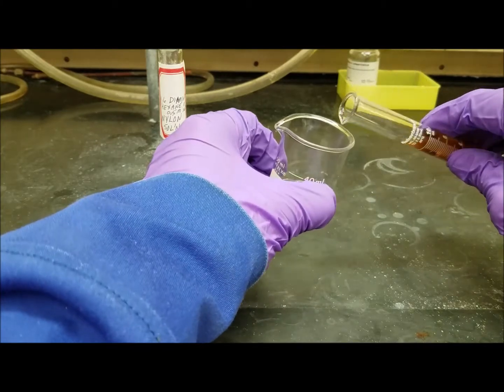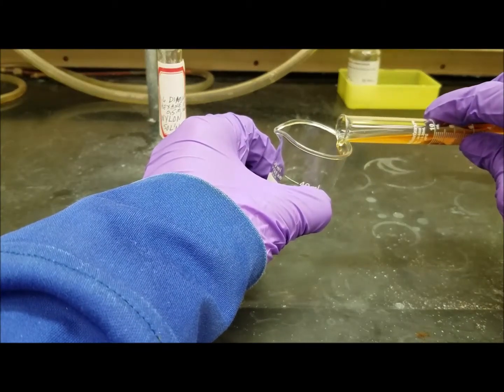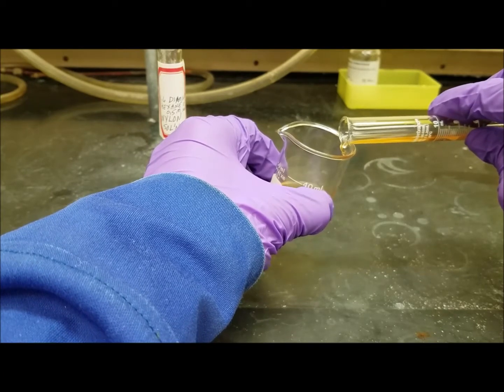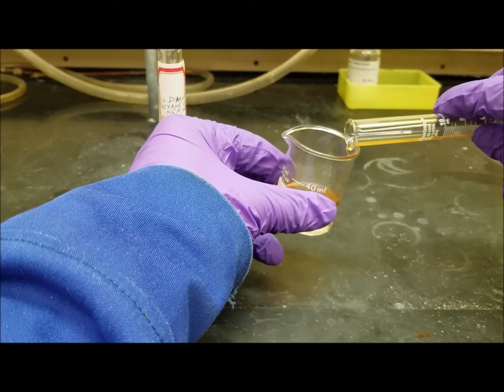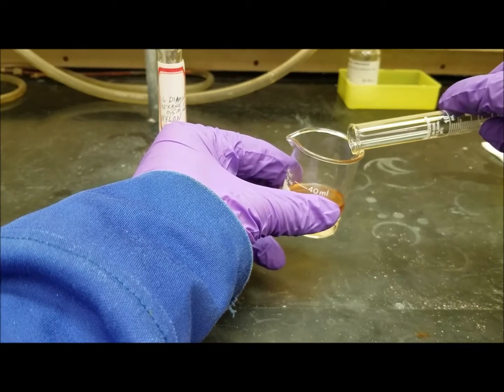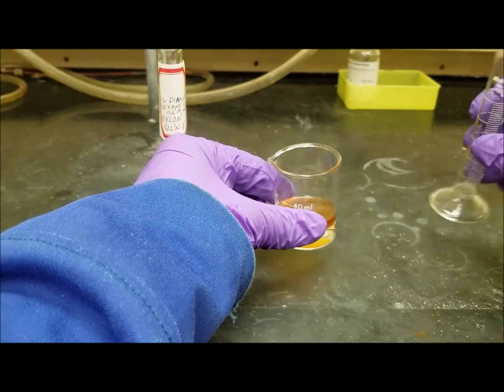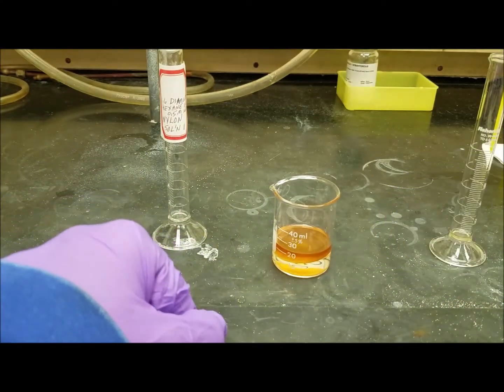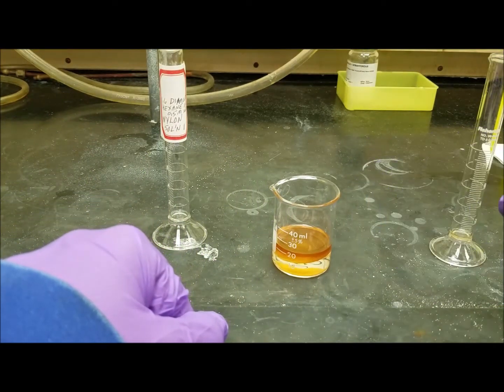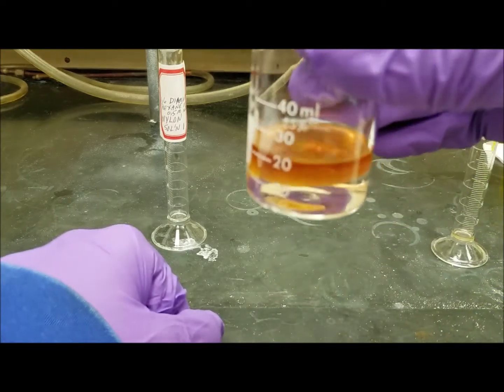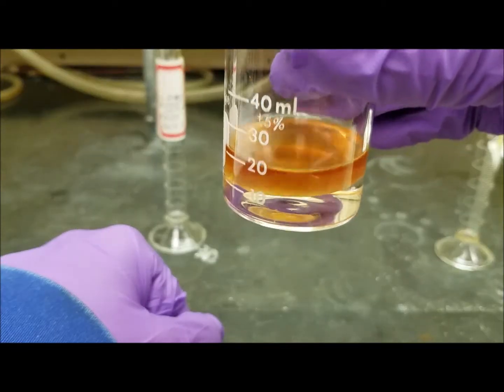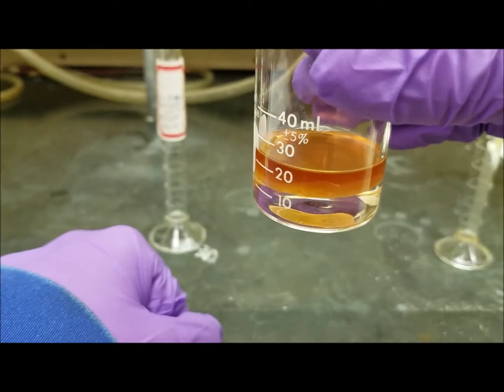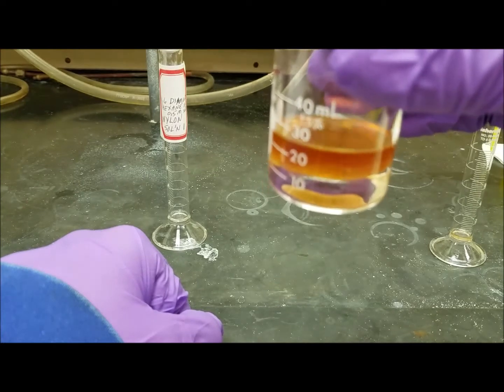So we should see two phases as I carefully pour this down the side. Yep. So now I see two phases, the adipoil chloride layer on top. And if you look, there's a little bit of a film right there in between the two layers.